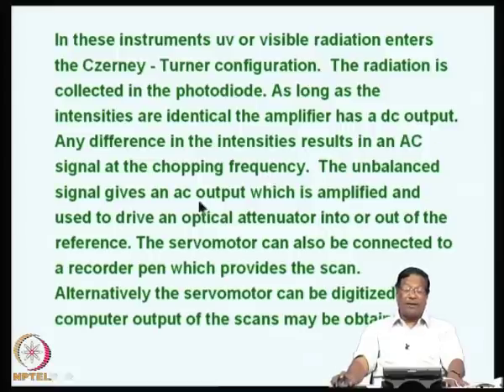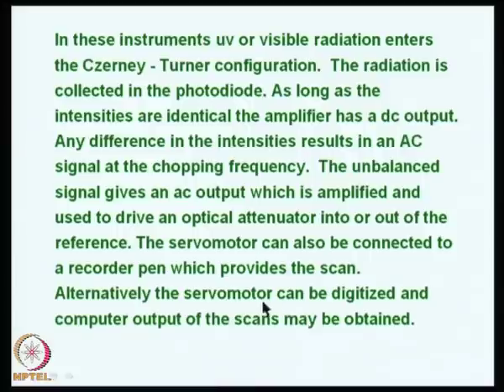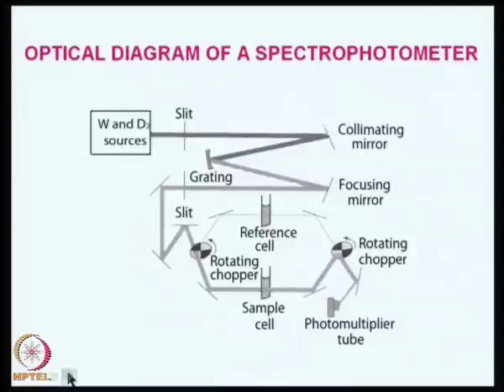The unbalanced signal gives an AC output, which is amplified and used to drive an optical attenuator into or out of the reference. The servo motor can also be connected to a recorder pen, which provides the scan. Alternately, the servo motor also can be digitized, and computer output of the scans may be obtained. This is also very simple.